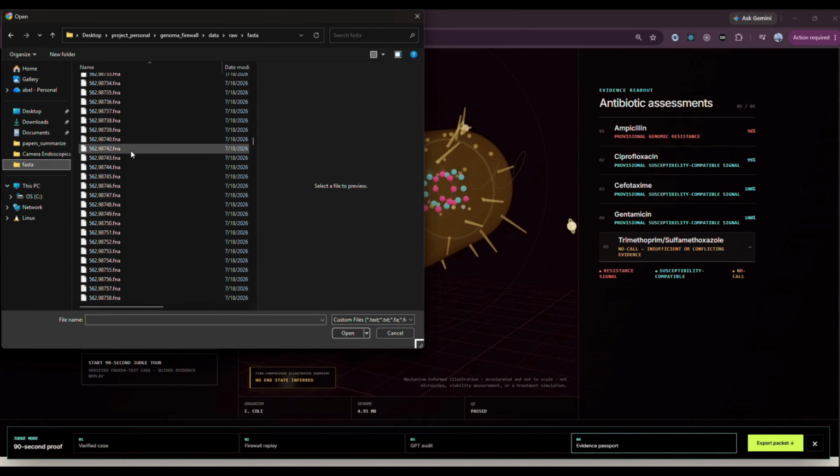GPT-5.6 Sol performs a constrained evidence conflict audit. It receives only allow-listed structured evidence, never raw FASTA, file names, genome checksums, or personal data. A deterministic validator rejects altered statuses, probabilities, identifiers, counts, or required warnings. The model can audit and communicate evidence, but cannot modify the scientific result.